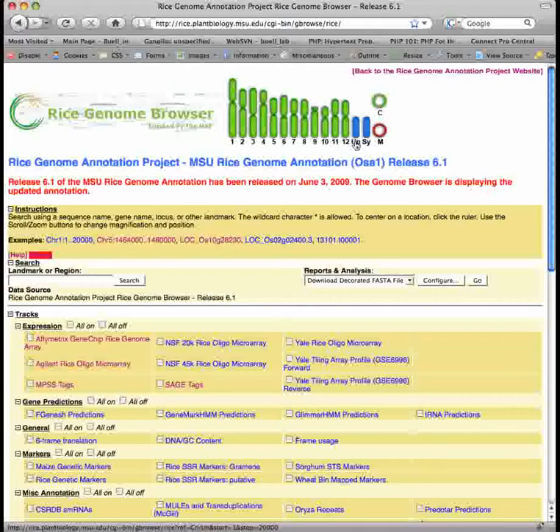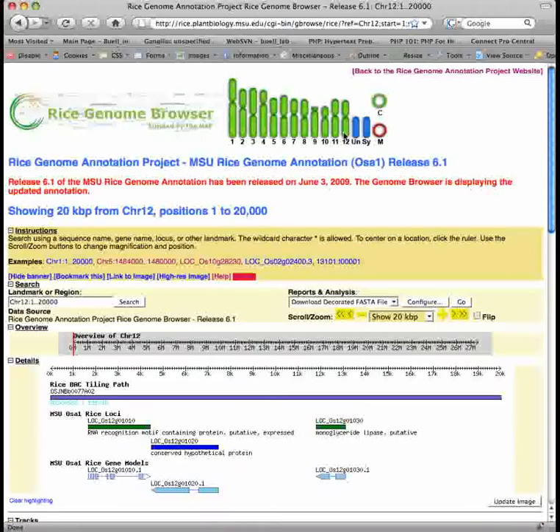Just click on one of the glyphs to load the browser. Alternatively, you can also view regions of the genome by using the search function in the landmark or region search box. Type in the box either a keyword such as a functional annotation like aquaporin, or a locus ID. First, let's try using the landmark sample locus.